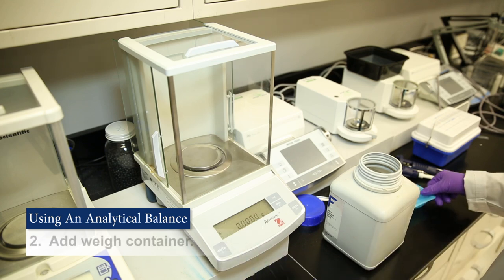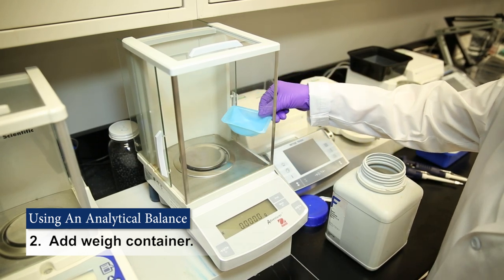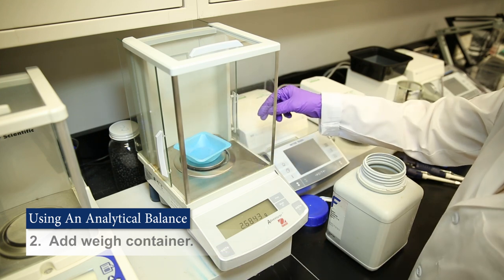Once your balance is on, you'll want to add a container or a piece of weigh paper or a beaker to hold your material separate from the pan of the balance.